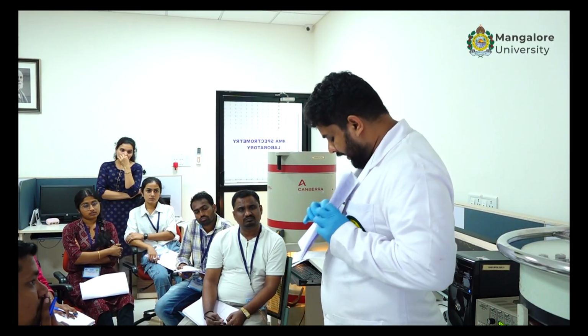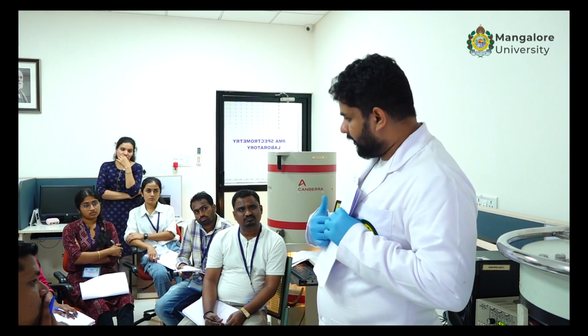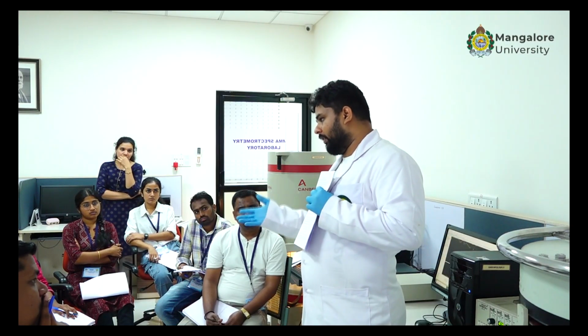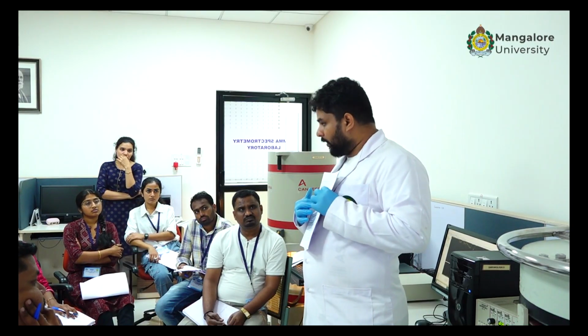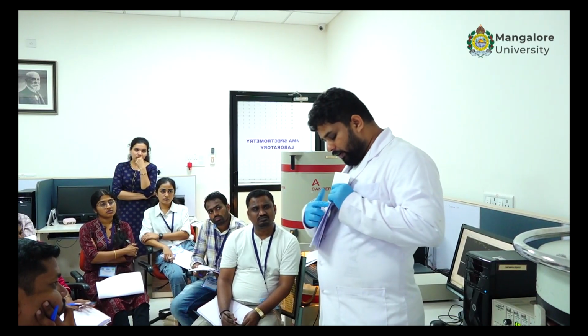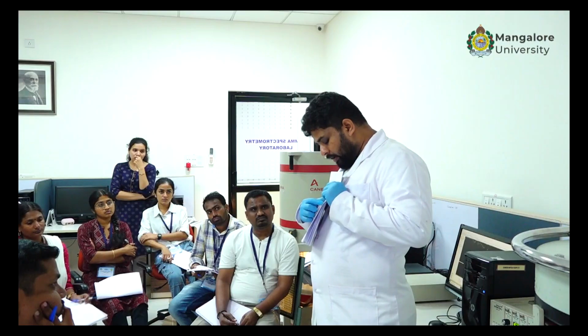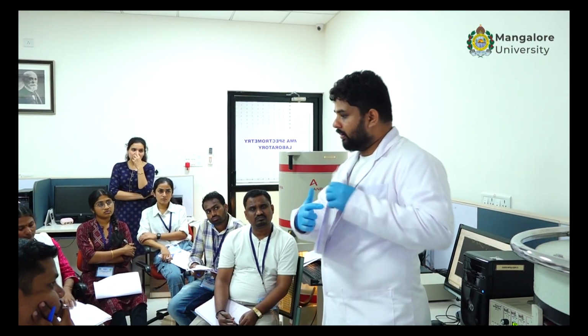These are the units that they have given, and some more additional information. There is no good, better, best here. You have either accepted, not accepted, and warning. They will calculate precision and accuracy. If both precision and accuracy are accepted, your sample is accepted. If both are not accepted, your value is varying a lot. It is not accepted. Warning is when the trueness rating is accepted, but precision is not accepted.